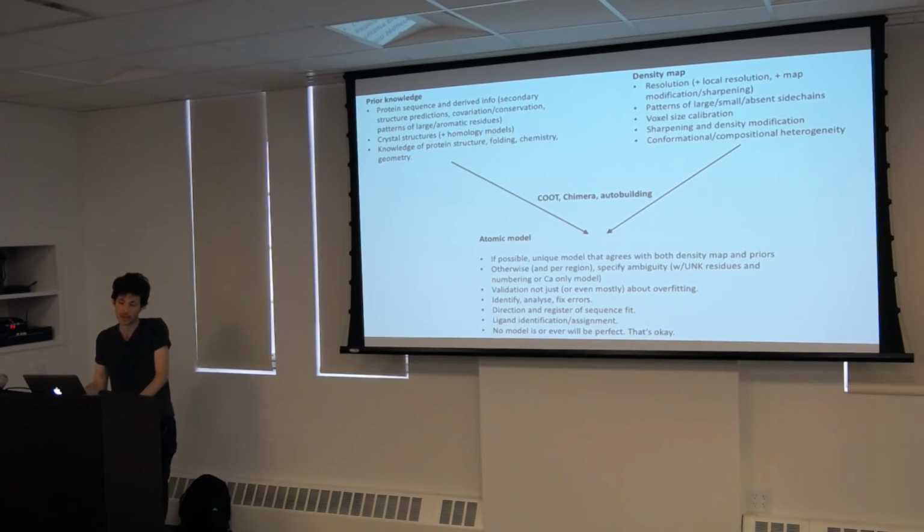And that may require collecting more data. It may require, for ligand identification, you may want to collect a data set that's lacking the ligand, calculate a real space difference map, do some other things like that.